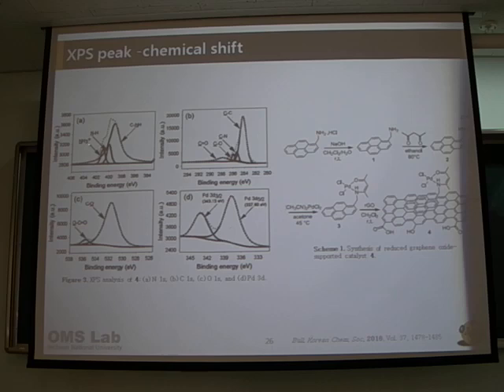이 아모늄은 어디서 나오는 거예요? 맨 처음에 HCl, HCl. 이거야? And this XPS is the XPS data of what? Which one? Number 4. Number 4, last final one. Nitrogen, N1S, nitrogen. This is a high resolution, that means deconvolution data. And where do you get the ammonium? Ammonium, the salt peak. How does ammonium normally get NH3 plus?